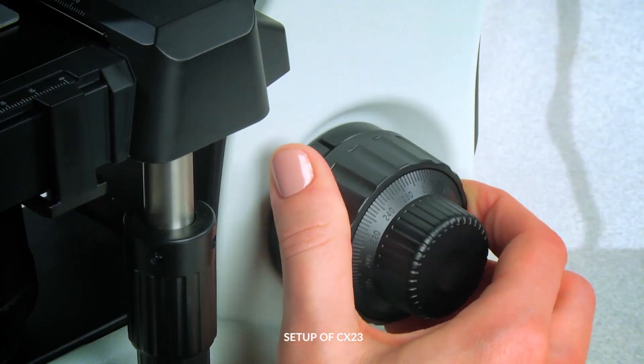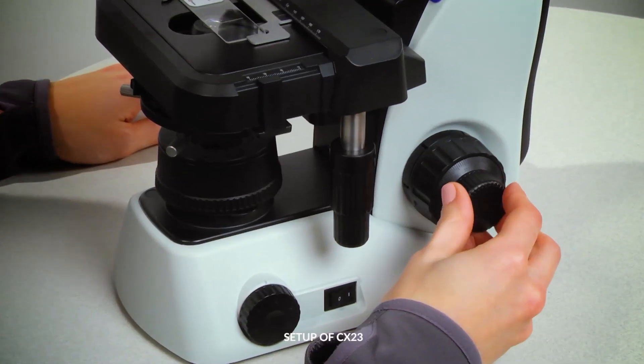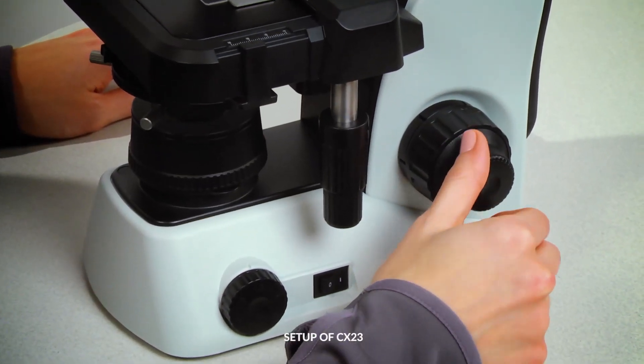To focus, rotate the coarse adjustment knob until the sample starts to come into view. Use the fine focus knob to make the image crisp and clear.